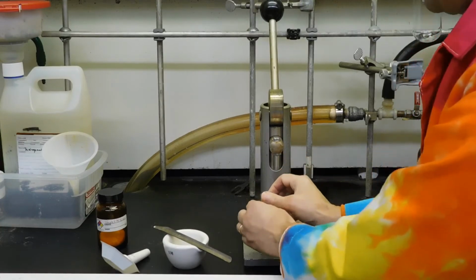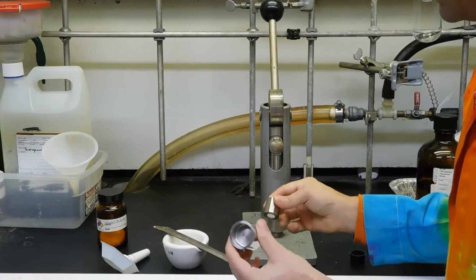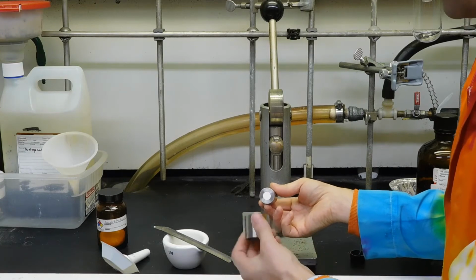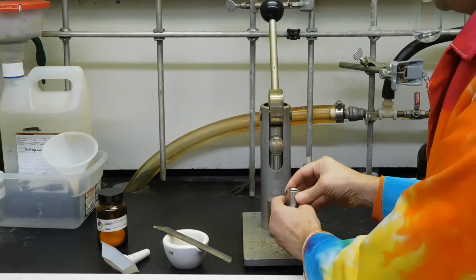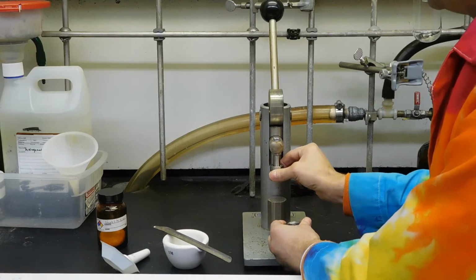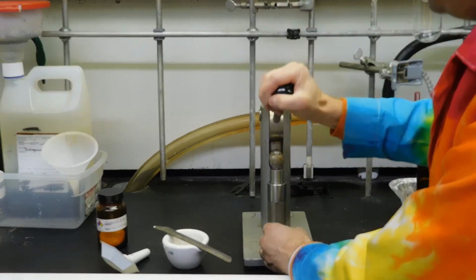We can see if we've got a good pellet by taking this off here, and you see nothing's stuck to the inside of the cup, and we got a nice flat surface there. Now we need to get it out. That's what the opposite side for this stand is. It's got a ridge on it. We can set this on the ridge and push the pellet out. Because of this clearance, you actually have to put this on a little bit, and then drop it down onto that. And then you can gently push the pellet out.